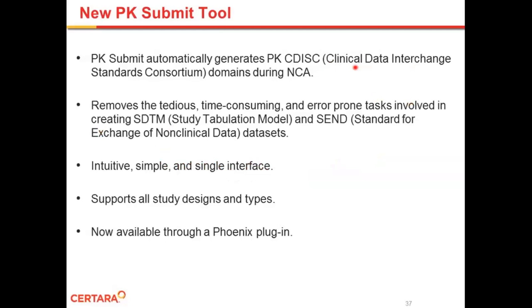But what this PK Submit tool does is it removes the tedious, time-consuming, and error-prone tasks involved in creating SDTM or SEND data sets. It has an intuitive, simple, and single interface supporting all study designs and types, and is now available through a Phoenix plugin, the PK Submit plugin.